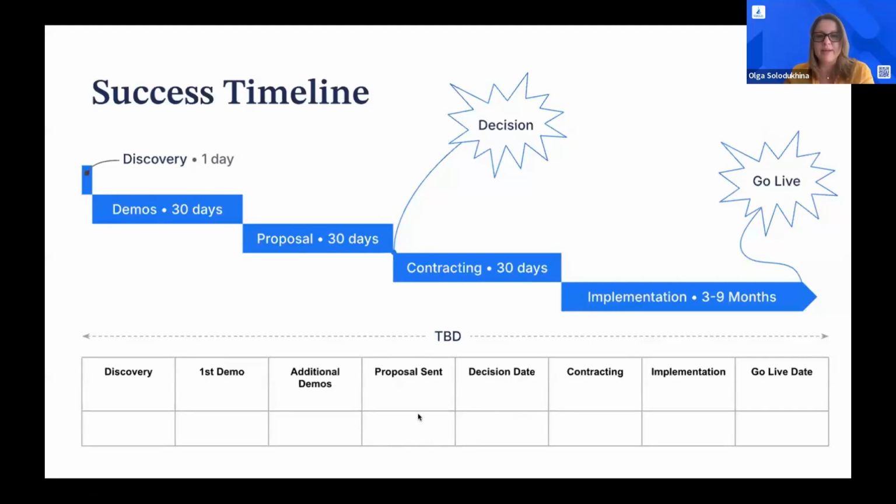Might be pretty lengthy. Not always the case. I've seen cases when we close the deal in 2 or 3 weeks, but most of the labs, of course, need time to think, and even discussing tiny little details in the contract might take weeks sometimes. So again, it depends on how fast you want to move forward.